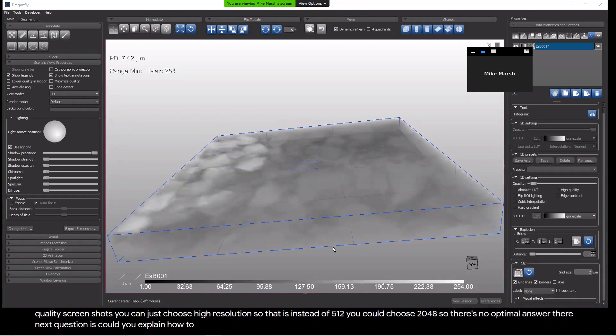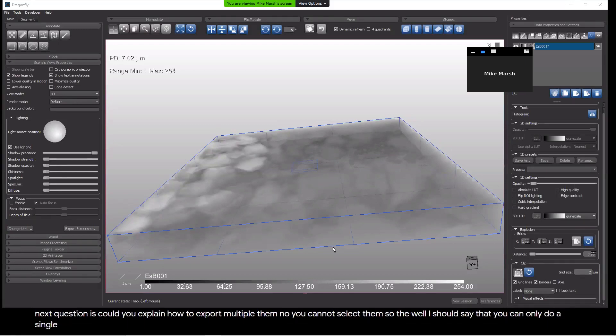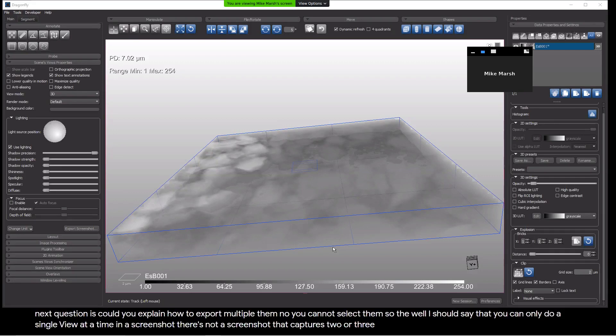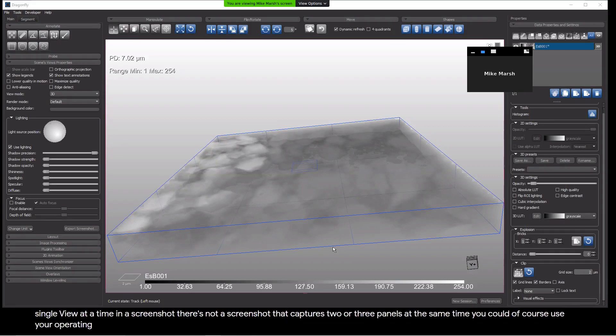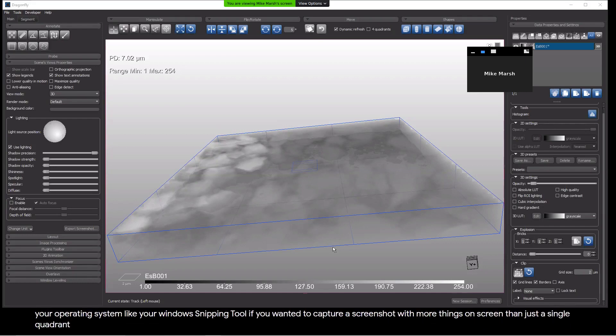Next question is, could you explain how to export multiple views simultaneously and select them? No, you cannot select them. I should say that you can only do a single view at a time in a screenshot. There's not a screenshot that captures two or three panels at the same time. You could, of course, use your operating system like your Windows snipping tool if you wanted to capture a screenshot with more things on screen than just a single quadrant view.